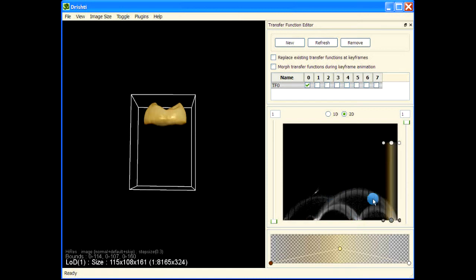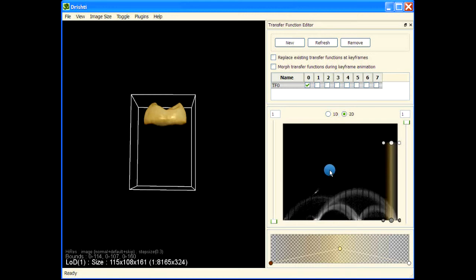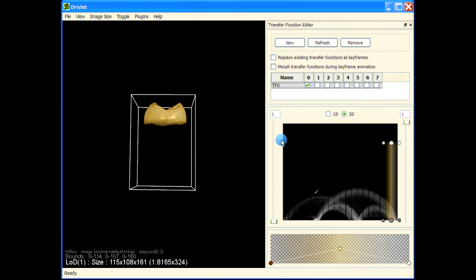The 2D transfer function shows us the relationships between these phases. If you look at the 1D histogram you know there are four phases, but it is really hard to know what the relationship between these phases is — meaning what phases are close to what other phases. These arches have been created because we use voxel intensity on the horizontal axis and gradient magnitude on the vertical axis.